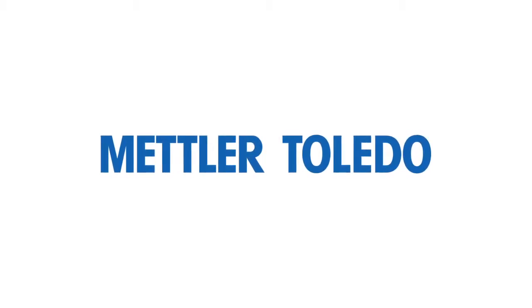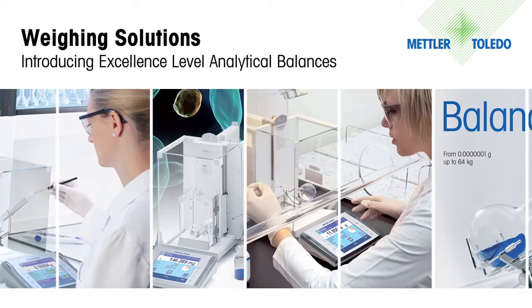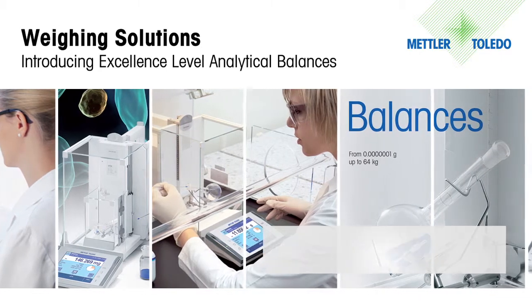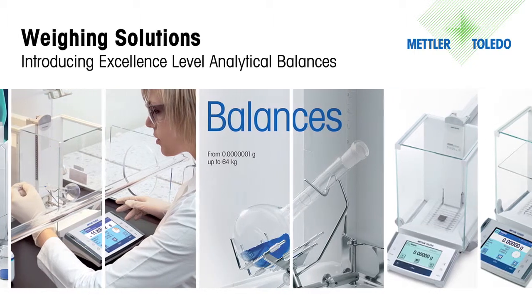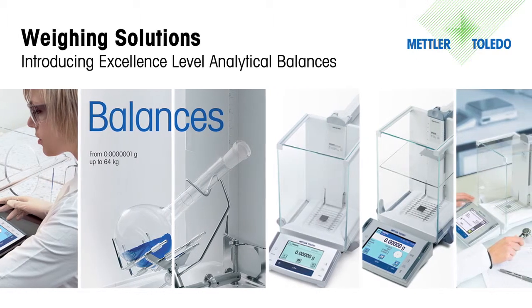Mettler Toledo Excellence Level Analytical Balances provide the perfect combination of leading-edge weighing technologies and incredible ergonomic design. With unparalleled weighing performance, ease of use with touchscreen technology, and the utmost in data security, Excellence balances can increase productivity and quality in the laboratory.